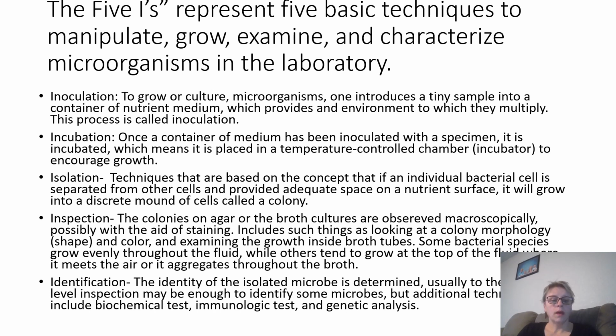And then we have identification. The identity of the isolated microbe is determined, usually to the level of species. Inspection may be enough to identify some microbes, but additional techniques include biochemical tests, immunologic tests, and genetic analysis.